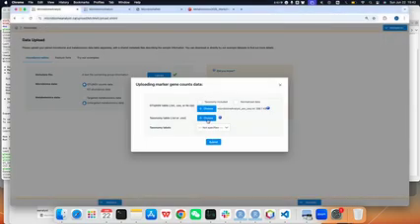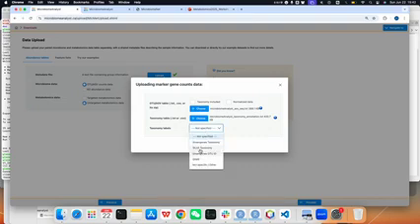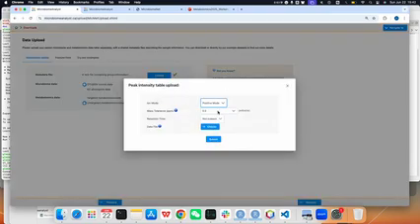We have the ASV sequence abundance and the taxonomy annotation here, and we specify the taxonomy labels. And then for the untargeted metabolomics data, if you use MetaboAnalyst, you should find this is actually the same. First, we should note that our data was generated from negative mode, and we use the default ppm tolerance.